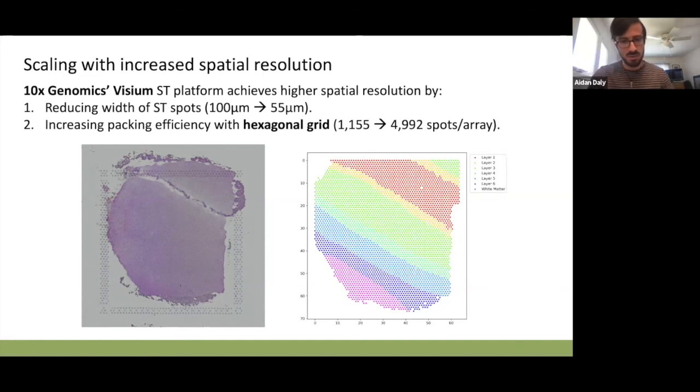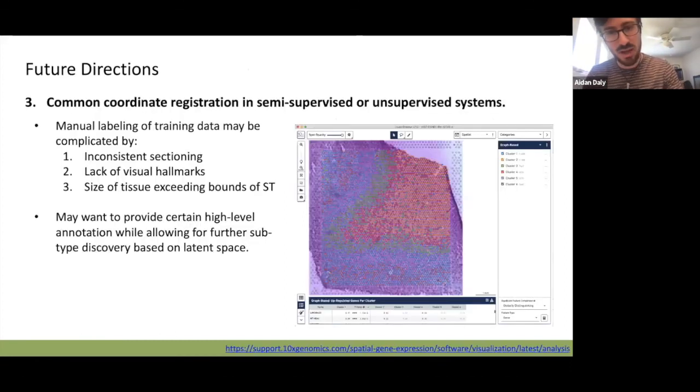No conserved structure, rather. That's part of what I was getting at the end, which is, if we were given a series of tumor samples loaded onto these ST arrays, can we have a pathologist go through and annotate them? Is there a clear pattern that even a pathologist can parse out?